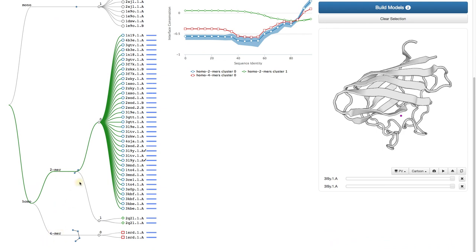This little figure here represents the topology of the interaction between the protein chains. If we look at the tetramer, it looks like four beads on a string.